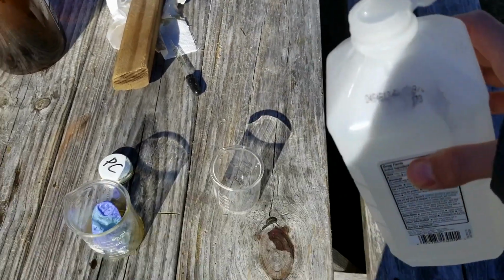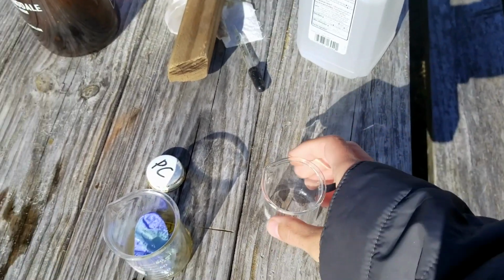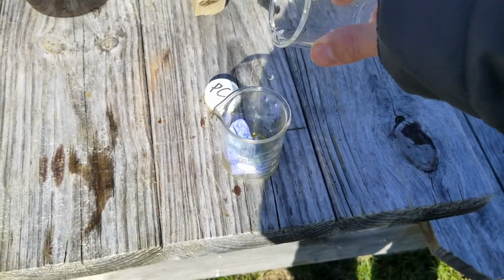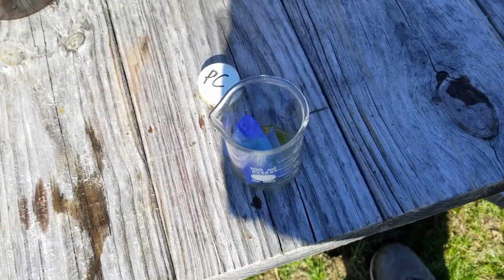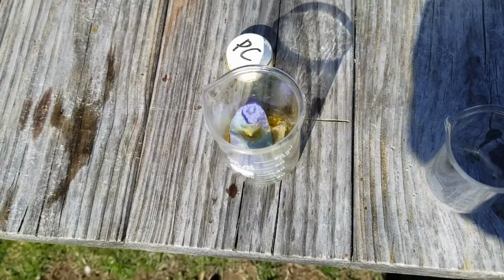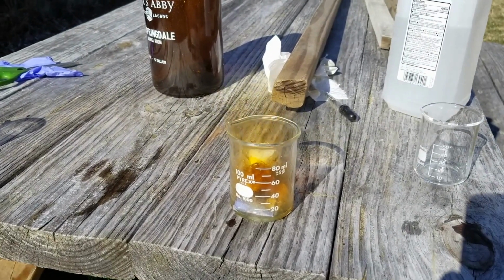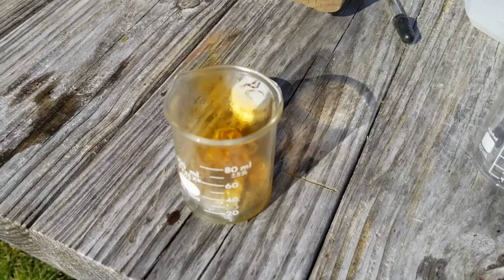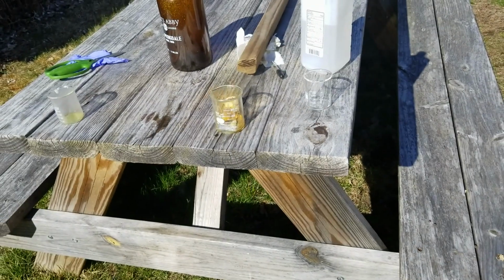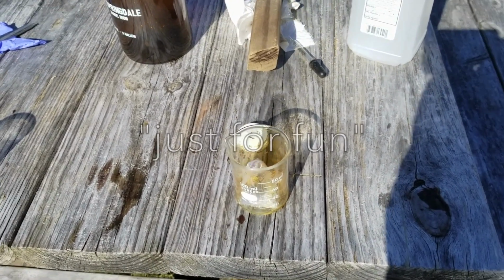Now let's fill this little beaker with some isopropanol. And what happens if you add the isopropanol to the nitric? Oh, nothing? Yeah, nothing really happens. It bubbles, of course, but it's not as exciting as before. Actually, no, those bubbles are getting more and more vigorous. Oh god. And you can see the nitrogen dioxide forming in there. That gas will kill you. That's why I don't like it. Let's add a bit more just for fun.